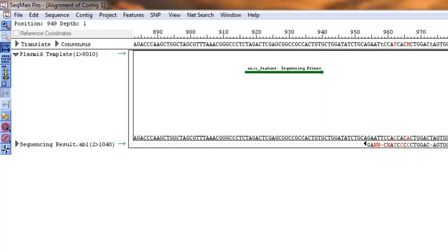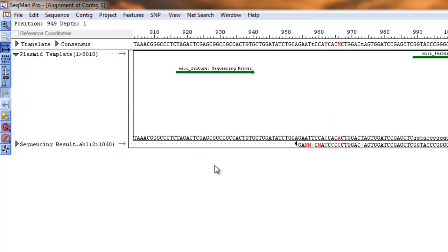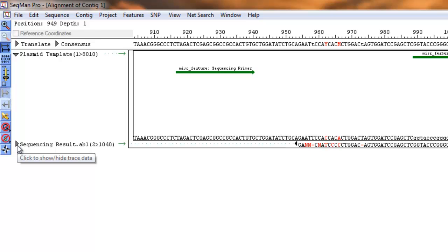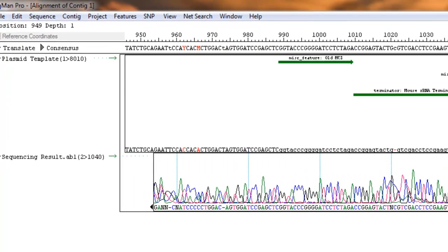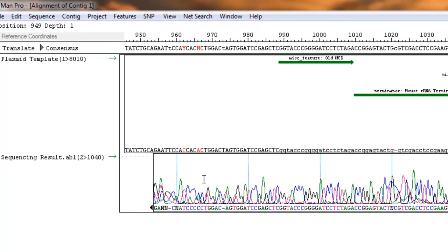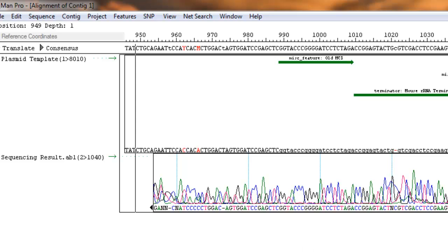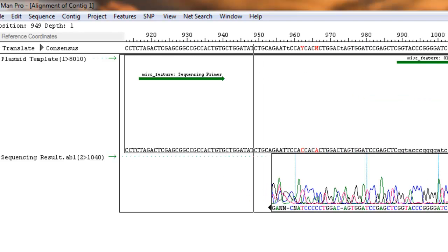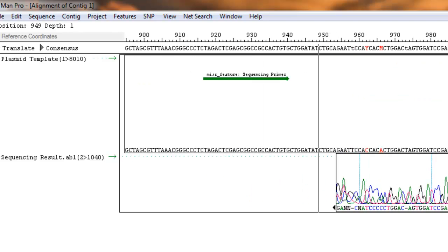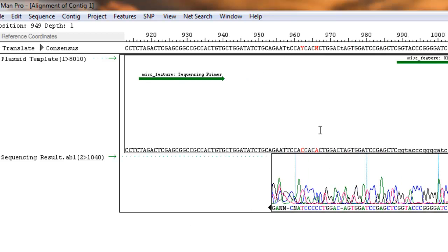But as you notice, as we read the sequence, it's just very messy and there's mismatches and deletions at the beginning. This is very normal and it's actually irrelevant. Because if you expand your sequencing result, which will show the chromatogram, what you can see, interestingly, is that at the beginning here, the chromatogram is very messy. You see the peaks are very low. They're not very precise. Some are high, some are low. For example, this is triple C. It's just three spikes like this. And they're not very sharp, not very focused. And this is why we get messy sequences at the beginning. It's actually irrelevant because the chromatogram traces bad. So it's okay if you get mismatches and weird stuff at the beginning. It's not a big deal. And that's basically why we don't have a 100% match.